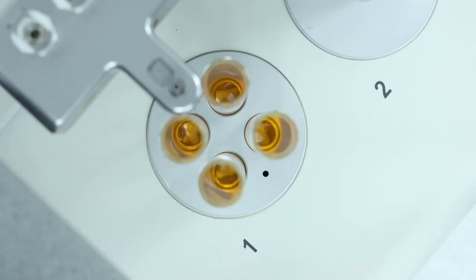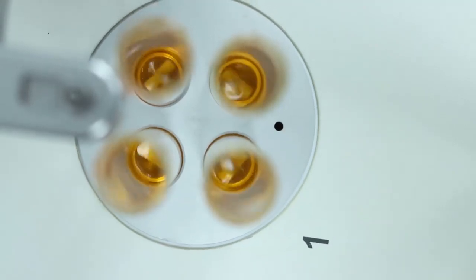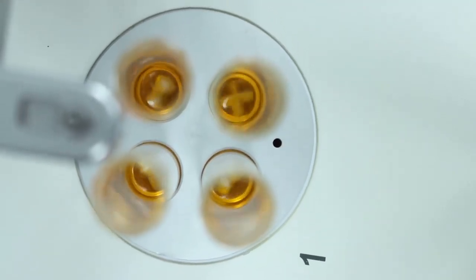All the tubes or vials are now positioned in a circle at the same distance from the magnet in the center, which means the stirring will be the same in all positions.